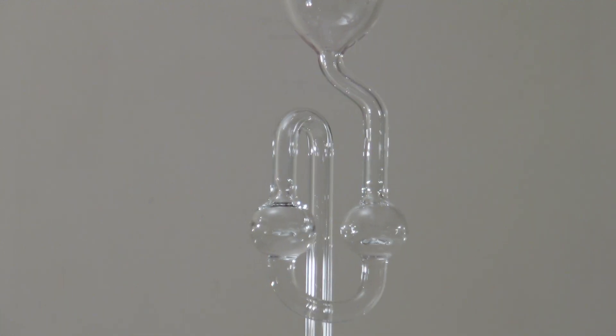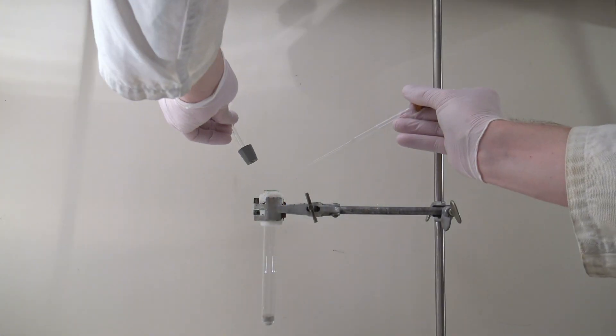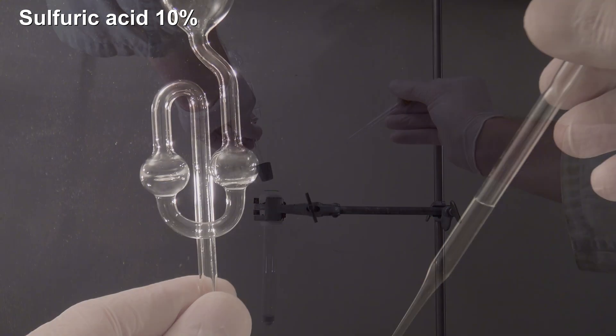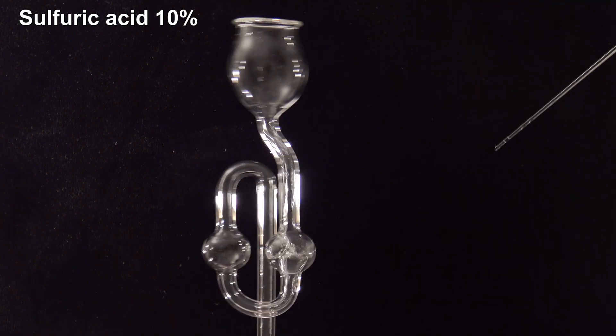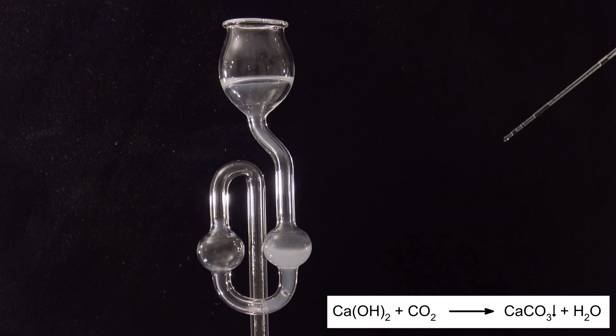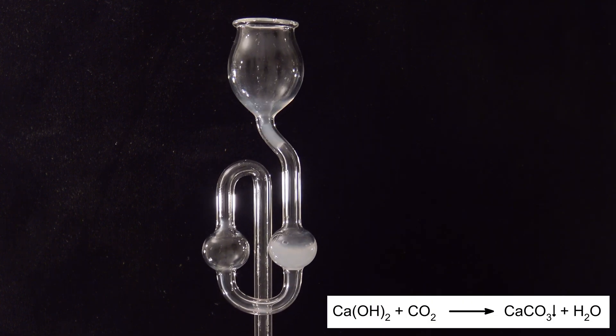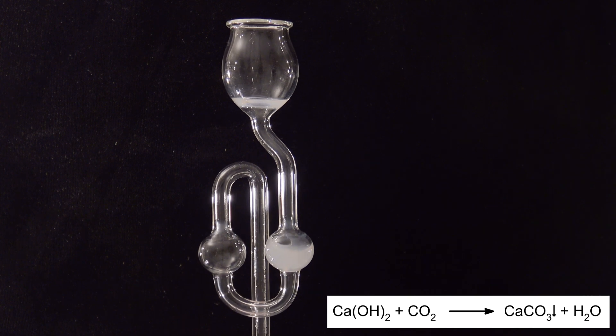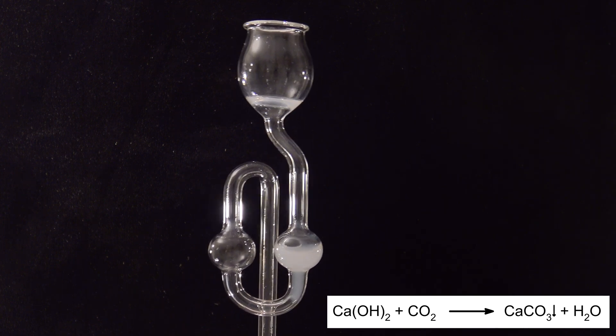Then a sample was added to a test tube. 10% sulfuric acid was added and the tube closed immediately with a fermentation tube. The calcium hydroxide reacts with CO2 to form insoluble calcium carbonate, which is a proof for the presence of carbonates in the sample.